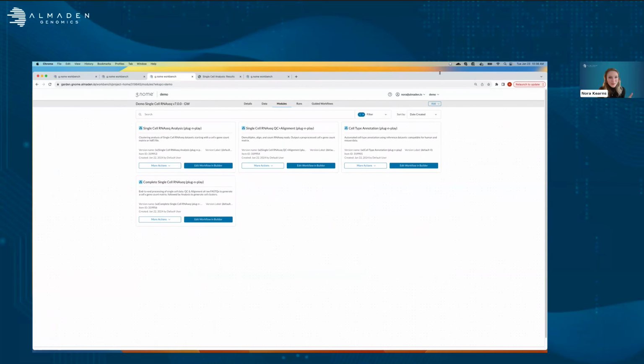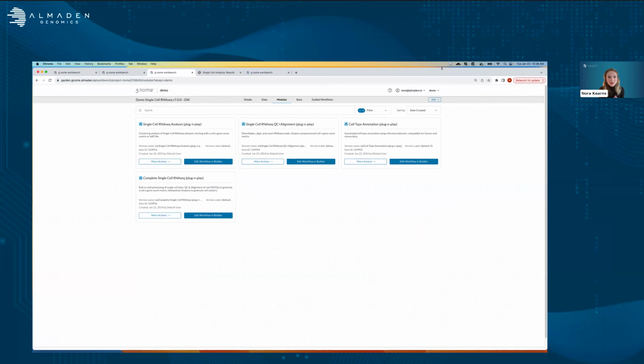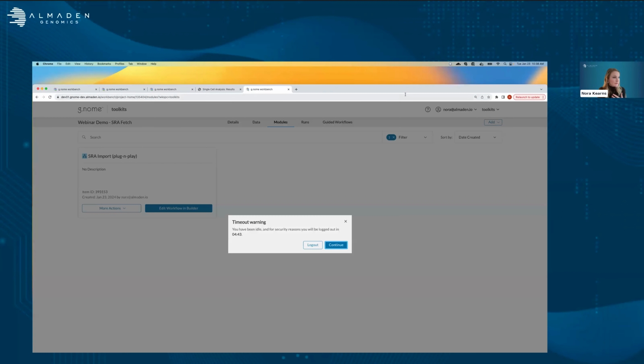Okay, so that is kind of a wrap on the single cell stuff. The last thing that I wanted to talk about is a common thing that we do as biologists, which is we want to look at someone else's paper and understand it, dissect it, and reproduce the analysis. So that can sometimes be difficult because of the size of the data that you are working with. So let's say someone has hosted a bunch of FASTQ files on SRA, how are you going to get access to their data, pull it to a place that you can work with, and reproduce their analysis?